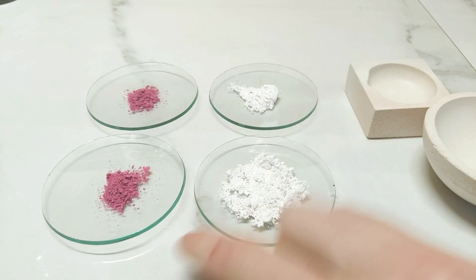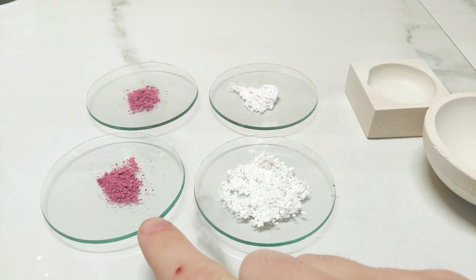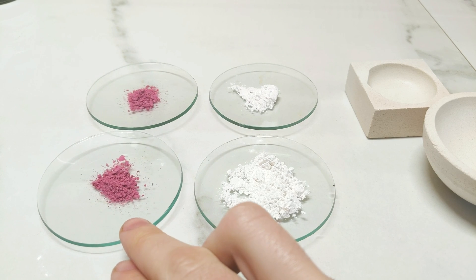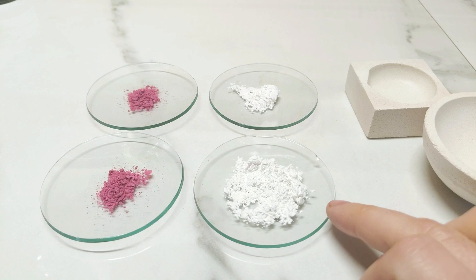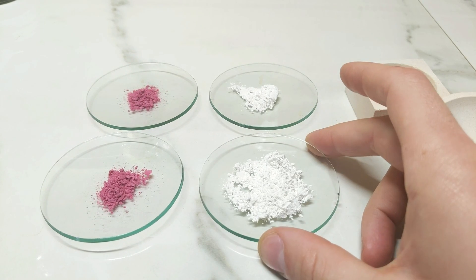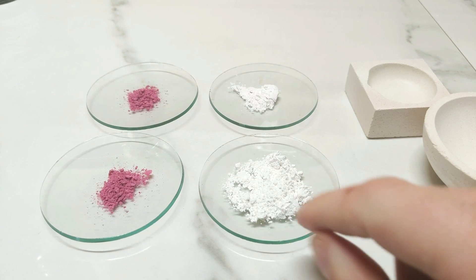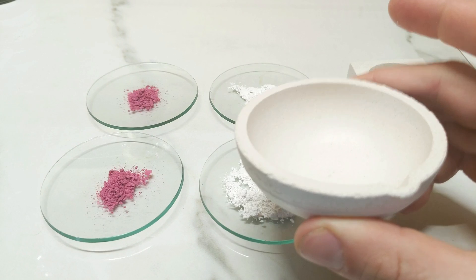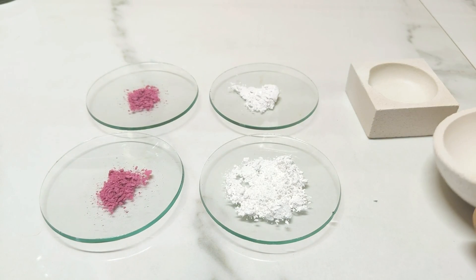For these first two little batches of cobalt blue I'm going to work with cobalt chloride, which we have here as a little pink salt, and aluminium hydroxide, which is the white powder here. The idea is to add a tiny bit of water, mix these into a paste, place that paste into our crucible, dry it, and then calcine it.